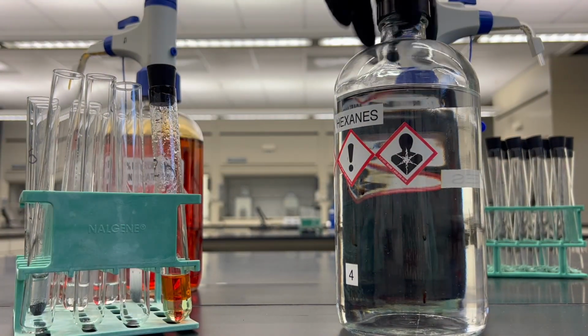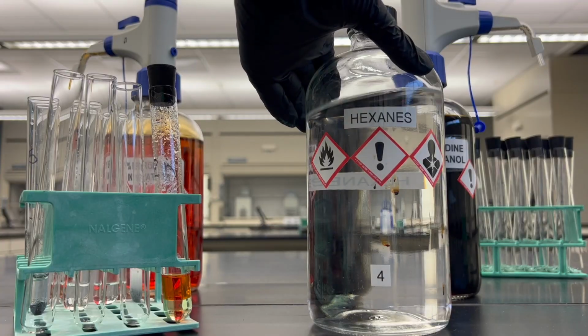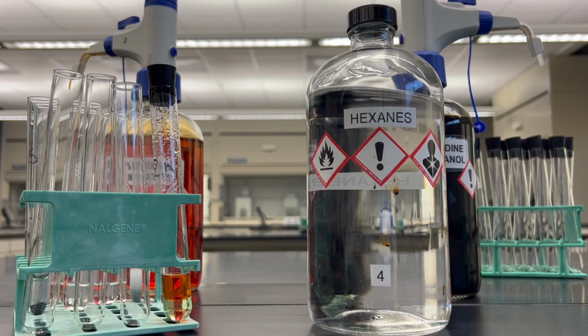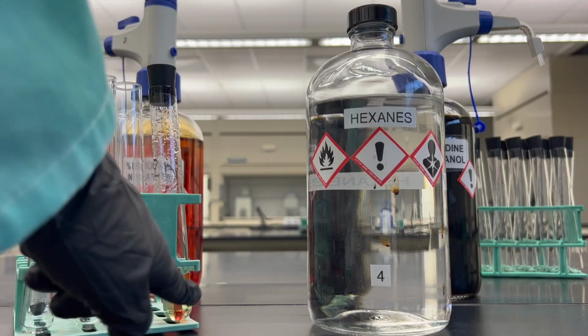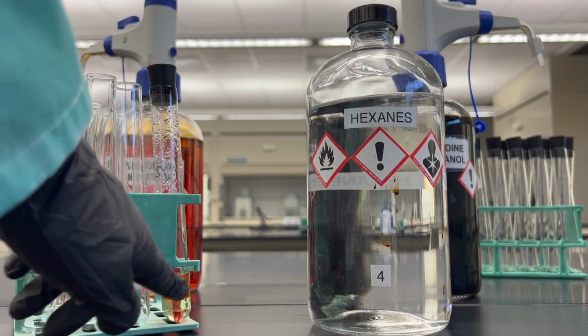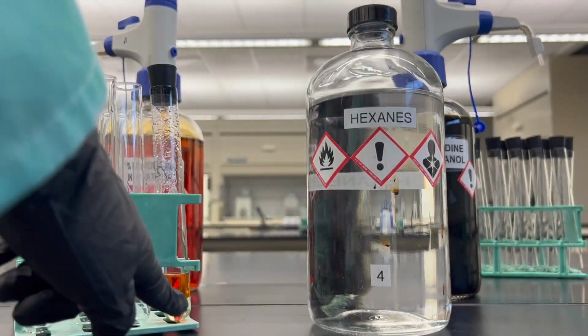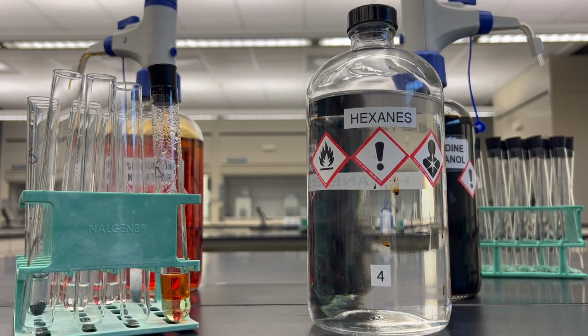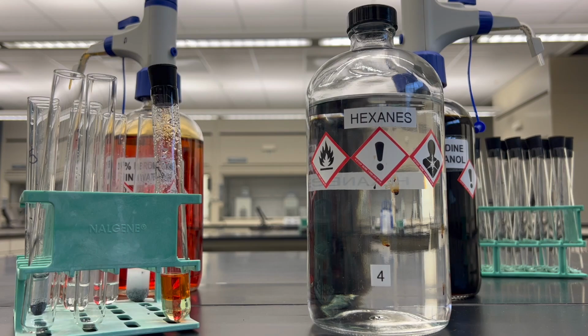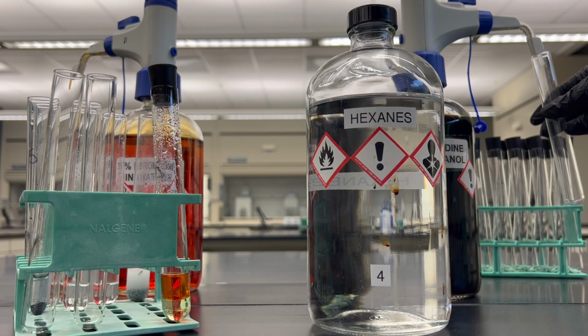Okay, so hexanes are nonpolar. Bromine in water is technically polar because of the water. So all of the bromine, which is nonpolar, reacted and went with the hexanes. And now we see that this is the bromine and this is the water. We're going to do the same thing with iodine, but now in methanol.